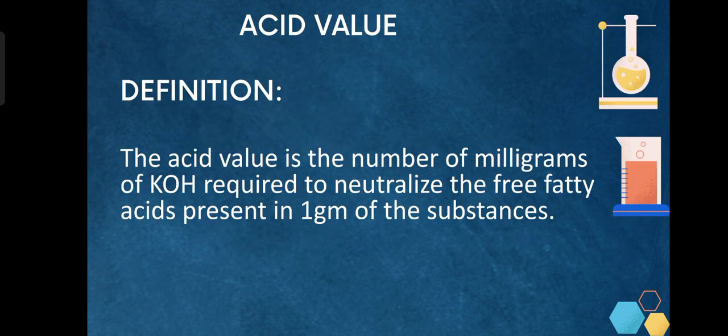Let's begin. So the definition for the acid value goes like this. It is the number of milligrams of potassium hydroxide which is required to neutralize the free fatty acids present in 1 gram of a substance.